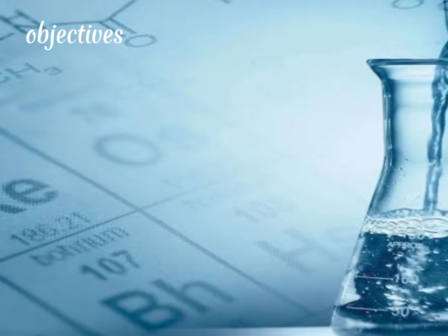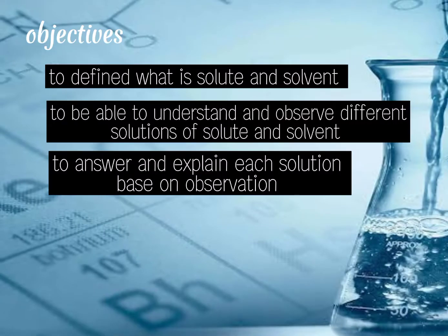Everyone, my name is Abigail Tandao and today I'm going to present the fourth and the fifth activity of analytical chemistry. Before I start my experiment, let me state my objectives.